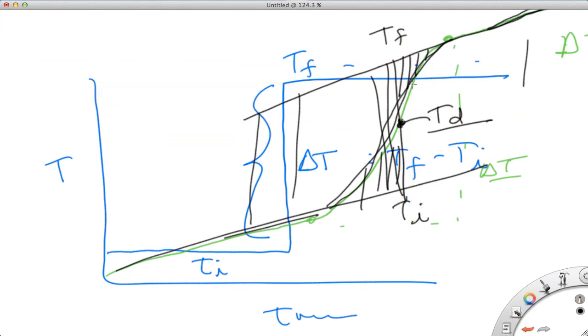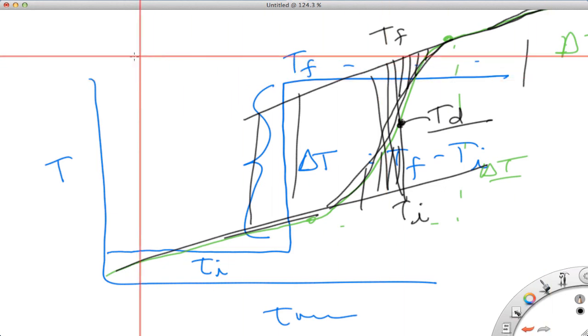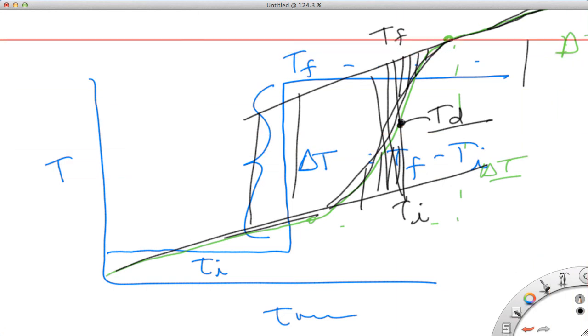Hopefully that gives you a qualitative sense of what we're doing to best determine the delta T, or the change in temperature, for these different combustion reactions. Again, I'll be back soon to further describe the quantum mechanical thermochemistry computational aspects of this lab as well.